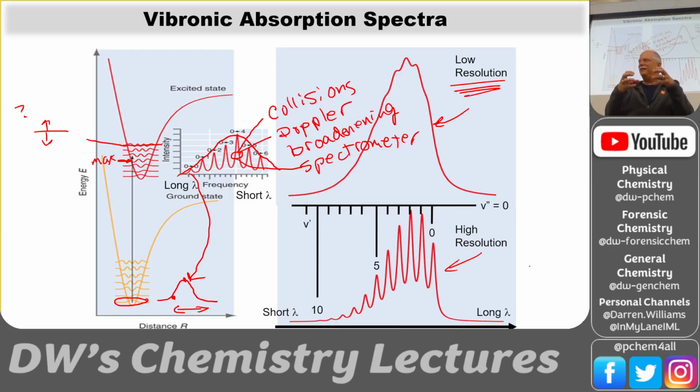So we would put the iodine cell in the UV-Vis spectrometer. We would crank the resolution down as far as possible, so the slits were very narrow. We're scanning the monochromator as slow as possible, and it would take about 30, 35, 40 minutes to collect this spectrum. So I've saved you that amount of time in the 4-hour lab to continue to work on the data. But I think this experience is somewhat valuable, so let's just pretend that we sat there for 30 minutes. Well, this spectrum came out very slowly, and you see the peaks bounce along. And that's somewhat exciting, but after a while you're like, okay, can we go down to the lab? Yeah, so that's what we do.